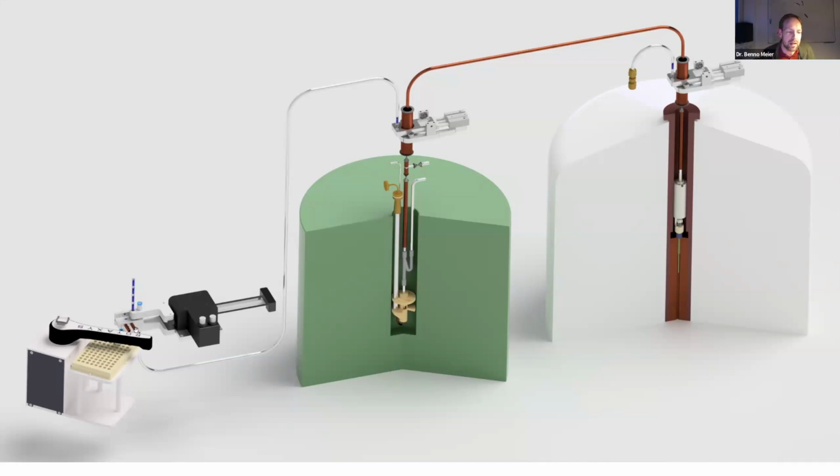So we do that by running liquid nitrogen through these copper tubes here. So these copper tubes are connected internally in this aluminum piece here. And that freezes the bullet. And then once it's frozen, we move this arm to a third position. And from there, we can now shoot it through this tube here. So it goes out at the bottom, and then it goes all the way here to the switch.